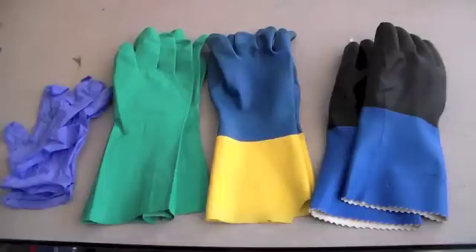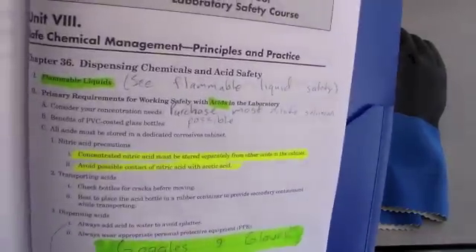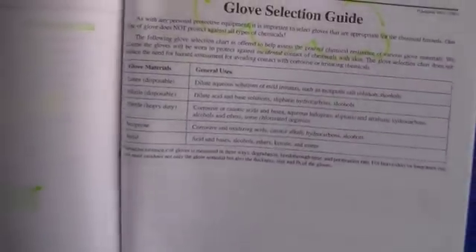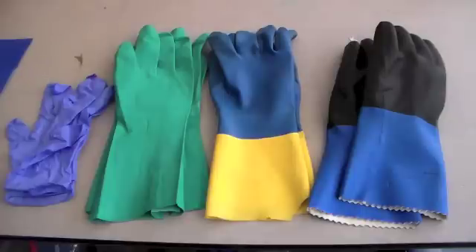So if you take the Flint Scientific Safety Course, in unit 8 chapter 36 notes — which is dispensing chemicals and acids safely — you can get the glove selection guide. This tells you all the different types of gloves and under what circumstances to use them. I'm just going to read this list off to you and tell you a little bit about each of the gloves if you cannot access this list.